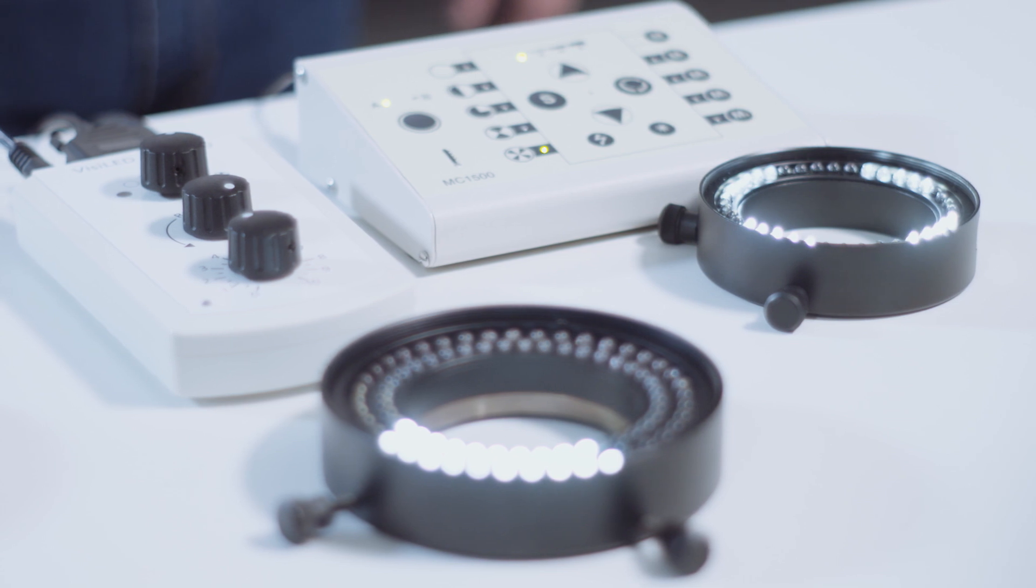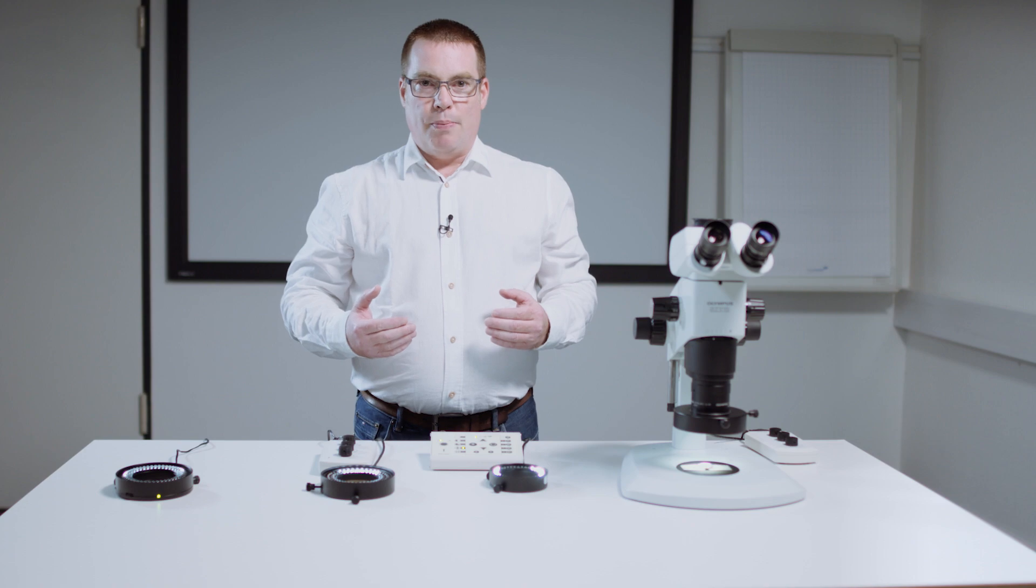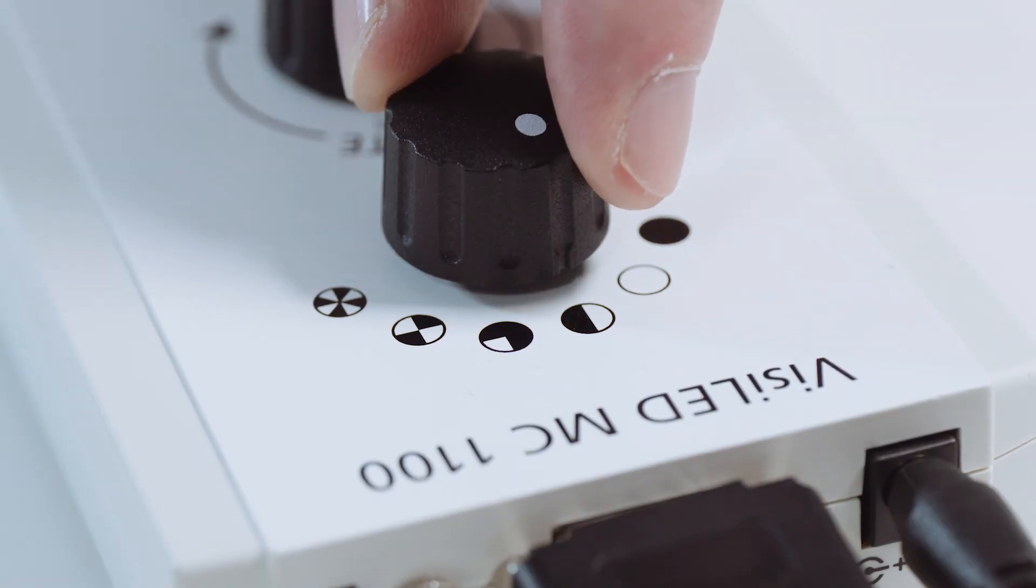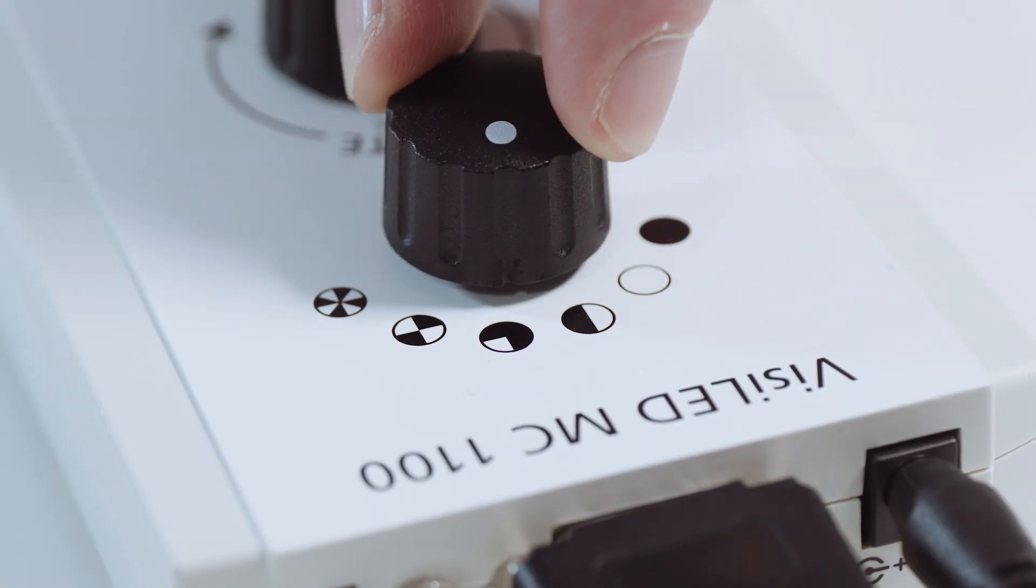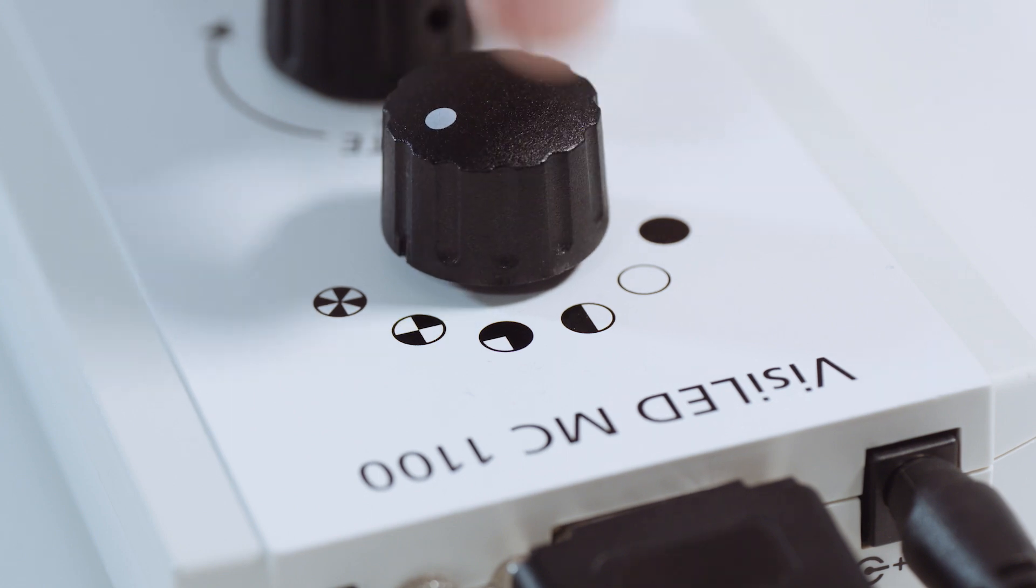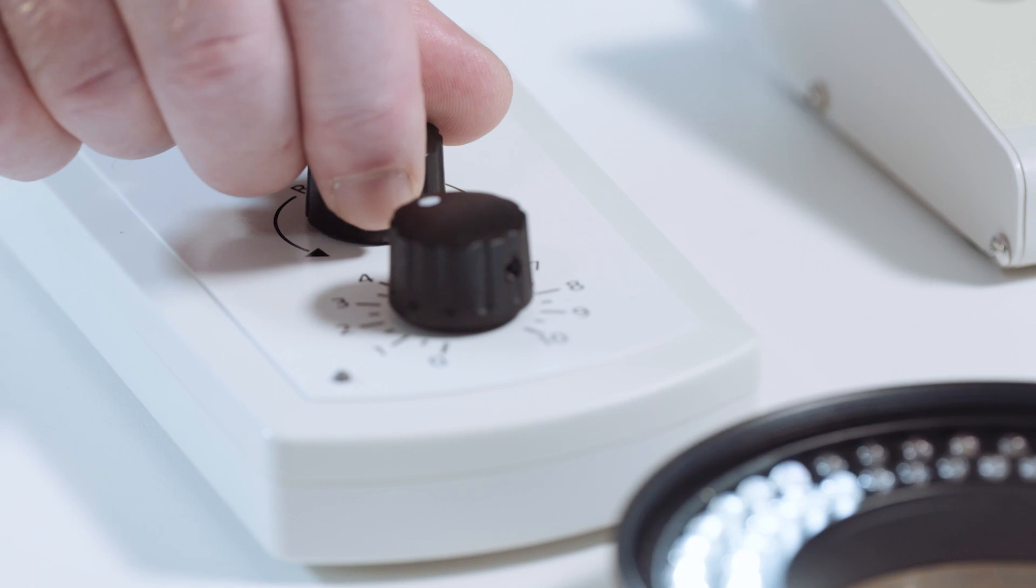Our MC1100 and MC1500 VZLED controllers offer a total of five different segment modes: full circle, half circle, quarter circle, two segments, and four segments. Each of these can then be rotated.